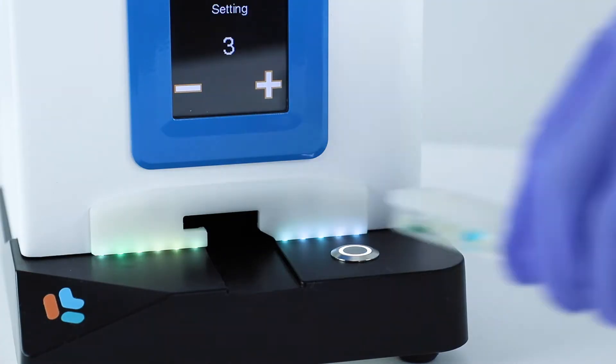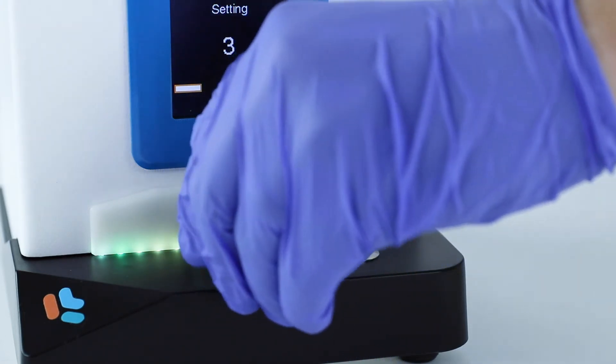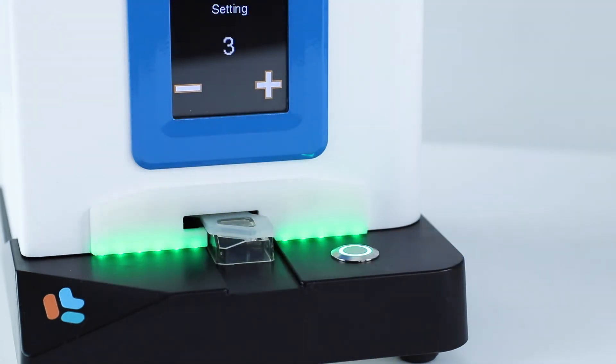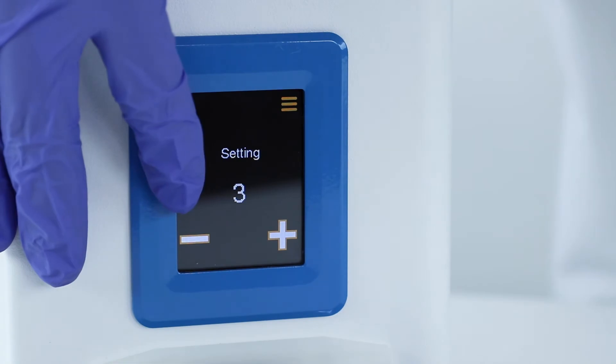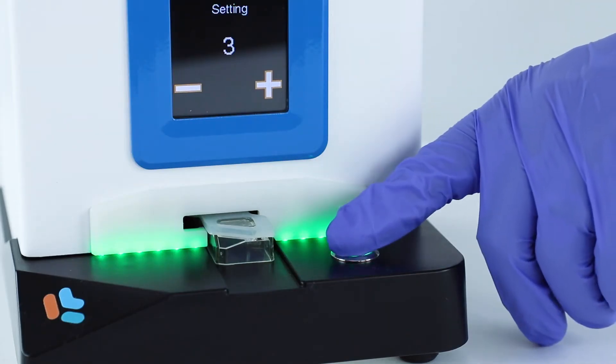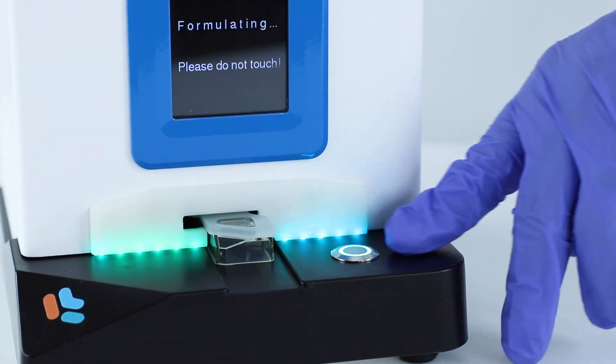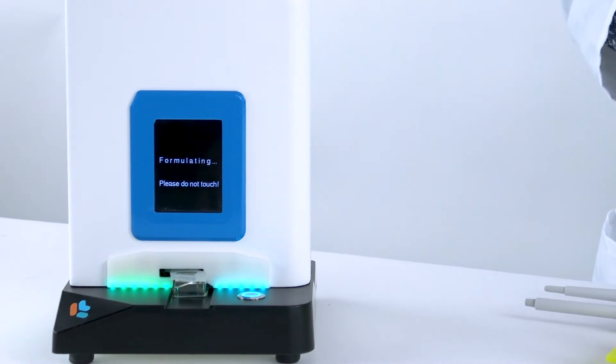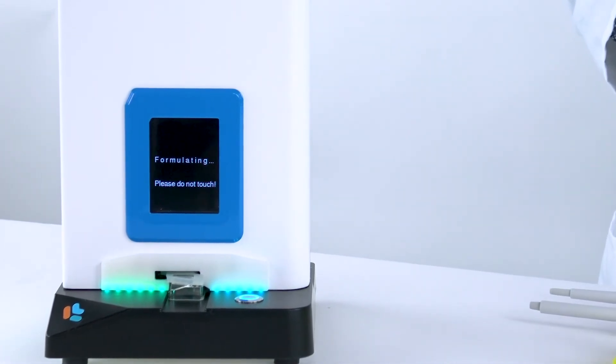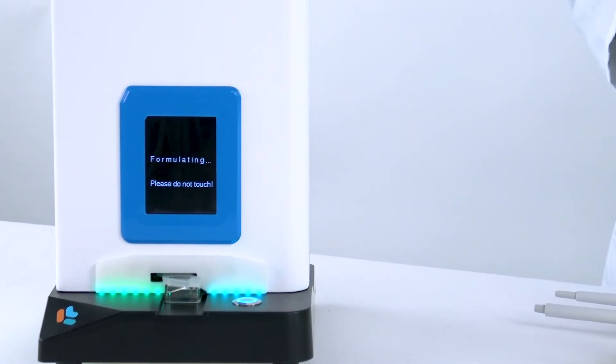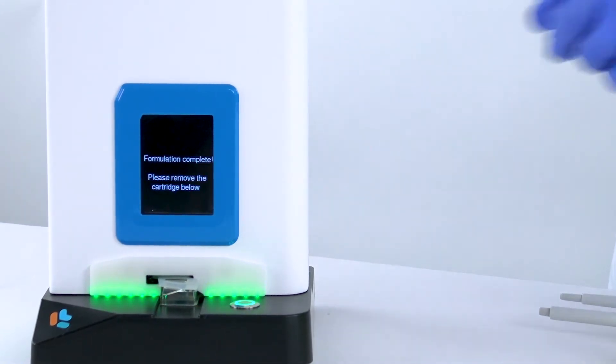Cap your cartridge and place it into the SPARK. The SPARK will illuminate green. Make sure the SPARK is set to the correct setting, and then press the button. The SPARK screen will indicate when the formulation is complete.